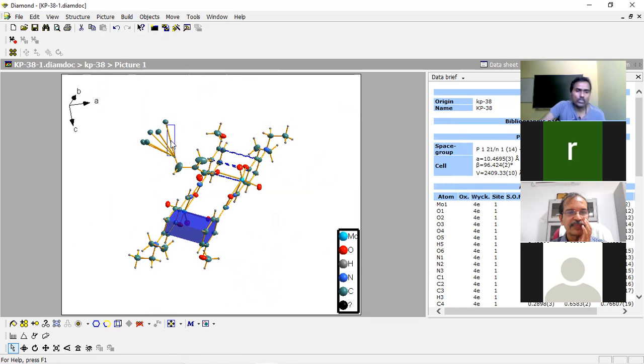And these bonds also we can remove, and we can check whether these are CG3. This must be CG3 ring, no? Therefore, we can check it again whether it is CG3. Oh yeah, C7, C3. Yeah, these are from the same. Yeah, C5. These are okay. C7, I don't know. If we have suspicion, we can delete it. No problem. Only one atom is enough to get the whole molecule.